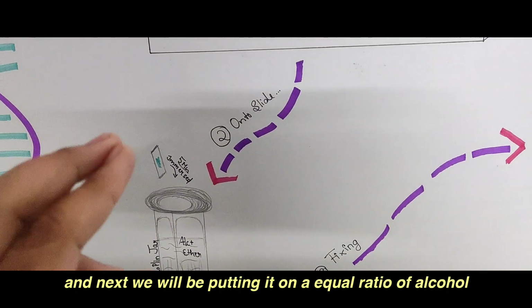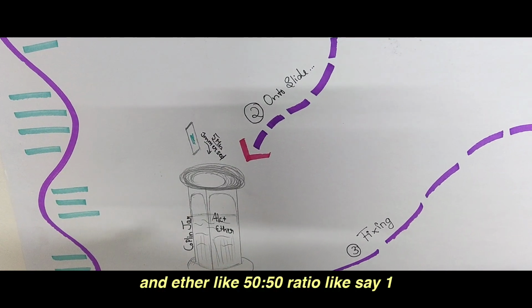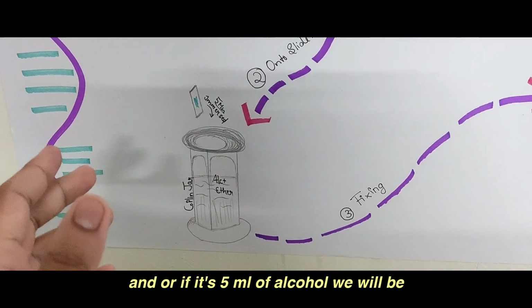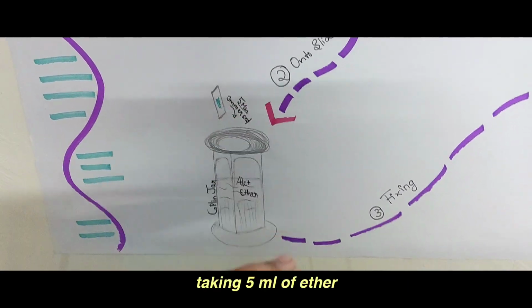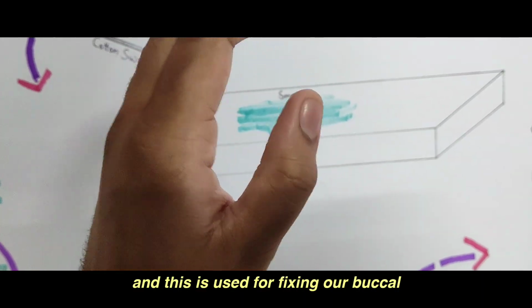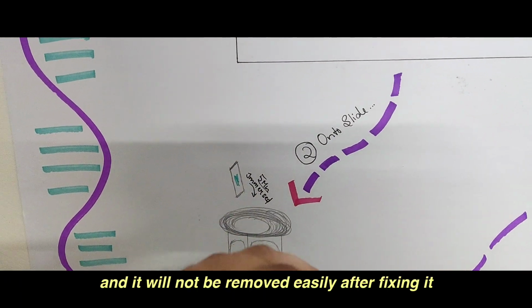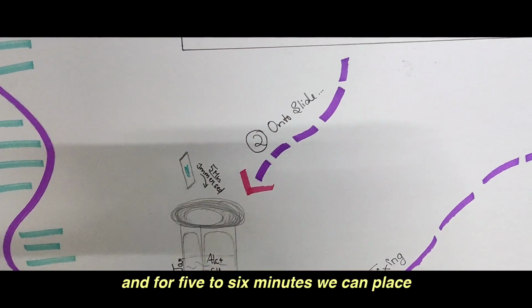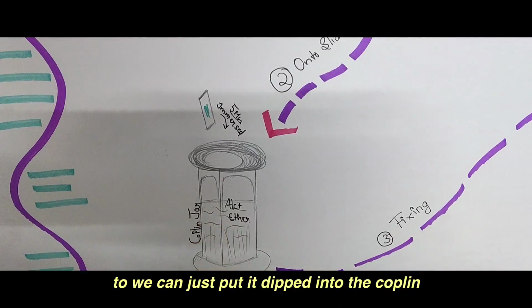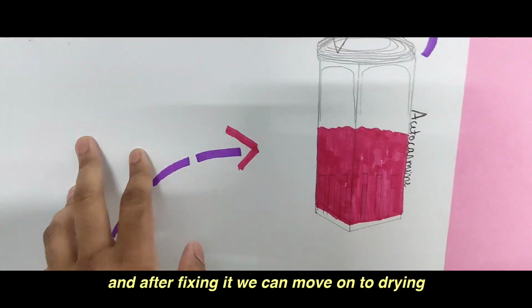After drying only, we are placing the swab smear on the glass slide, and next we will be putting it in an equal ratio of alcohol and ether, like 50:50, say 1 ml of alcohol and 1 ml of ether, or if it's 5 ml of alcohol we'll be taking 5 ml of ether, and this is used for fixing our buccal or salivary buccal smear sample onto the glass slide, and it will not be removed easily after fixing it. For 5 to 6 minutes we can just keep it dipped into the Coplin jar. This is called a Coplin jar, and after fixing it we can move on to drying.